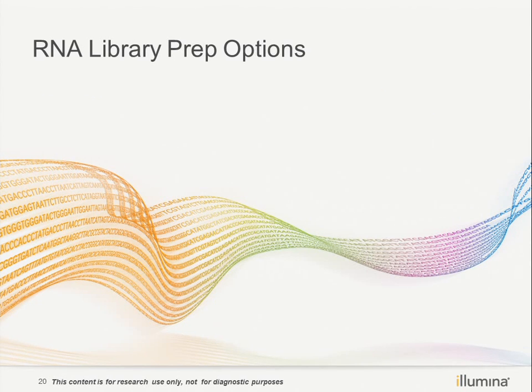So so far, do we have any questions on the DNA library preparation methods? Okay, so maybe let's go to the next part, the RNA library prep.